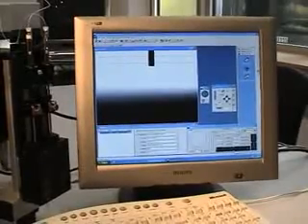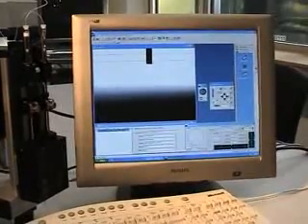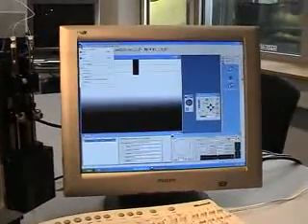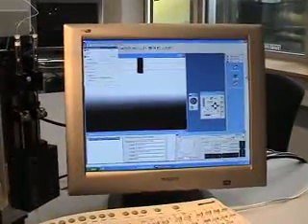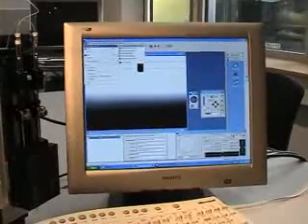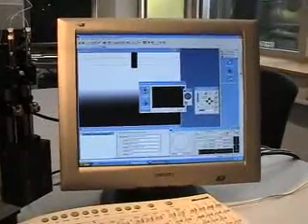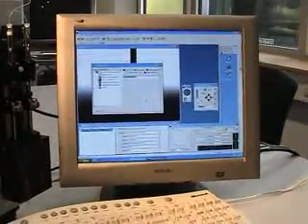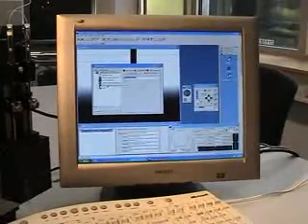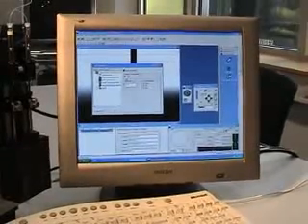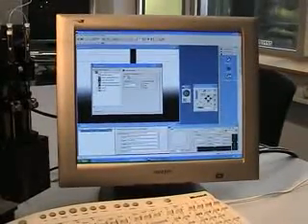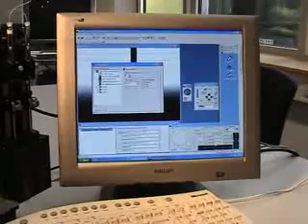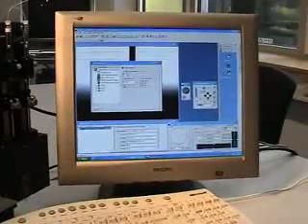We will show next the procedure how to make an automatic measurement. So we are opening here a definition of some macros, assigning several liquids for the measurement.